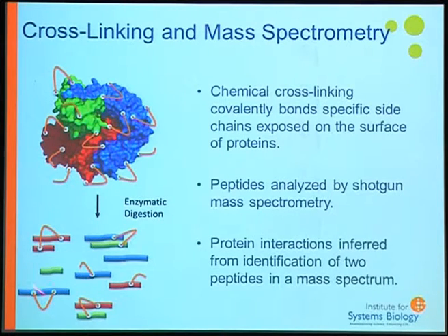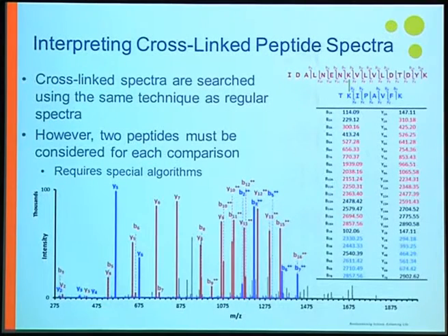But to do that, you really need to understand how you can get these mixed peptide sequences analyzed. As you know, when you're looking at a single peptide, it's quite easy. It's not too hard to actually do, and you can get this done automatically. But when you have numbers of peptides together, two, even three, then it becomes very complex.